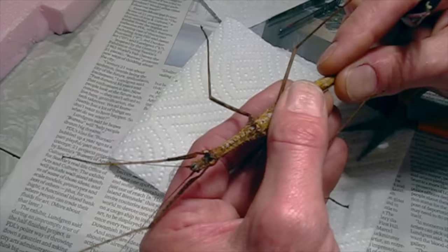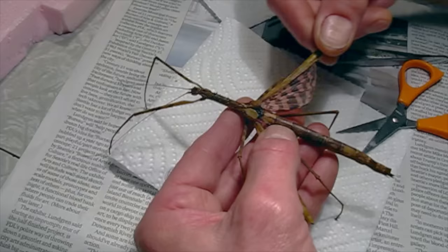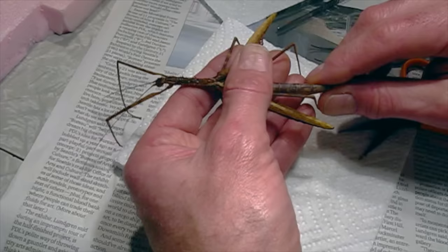Let's see how that looks from the top — pull the wings out. Oh yeah, that looks great. Might need to straighten it slightly, but yeah, that should work really well.